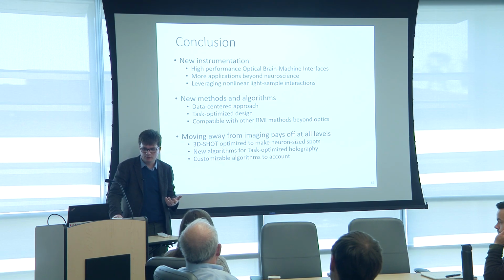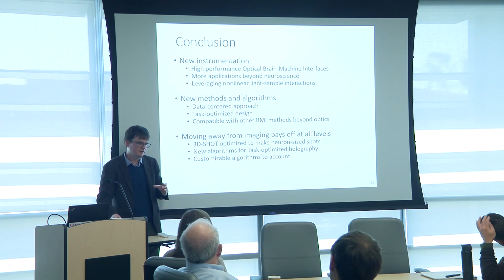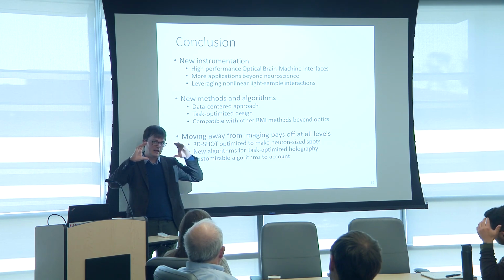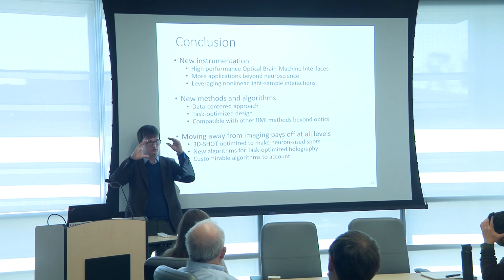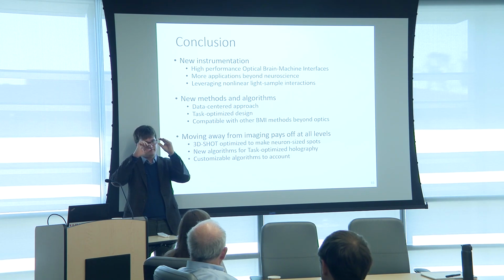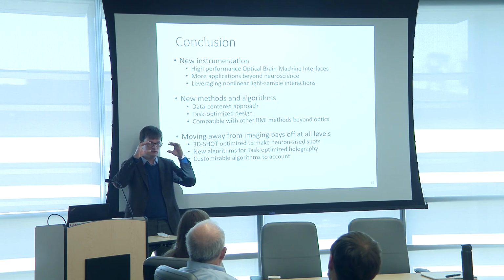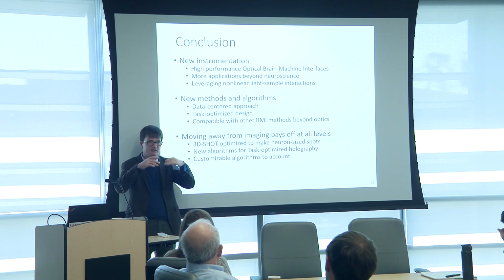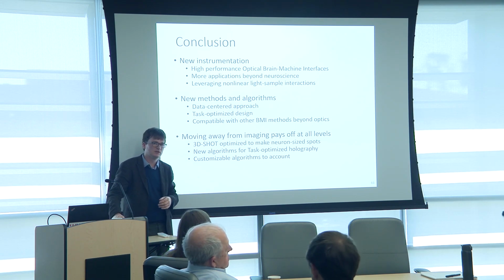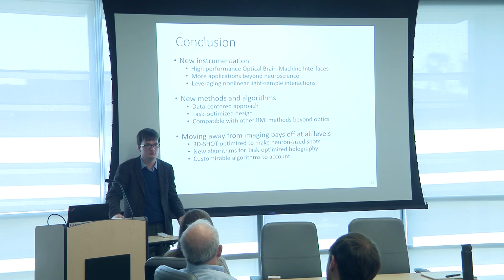Another technique that I heard of being developed by the lab of Valentina Emiliani at Paris involves playing with the rolling shutter of the SLM and with a galvo mirror shoot the beam at the top part of the SLM to use only a certain sub-portion of the pixels and follow the rolling shutter by illuminating only the portion of the SLM that was last updated to get a sub-window, so you pay with resolution, but you're able to enhance virtually the quality of your holograms. So all those are engineering techniques that can be applied to kind of go around the fundamental problem of SLMs, which is their slow nematic response.